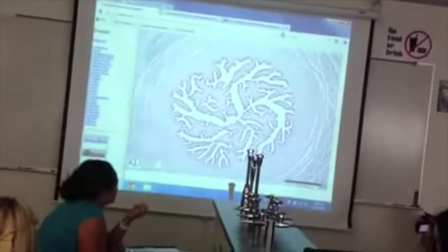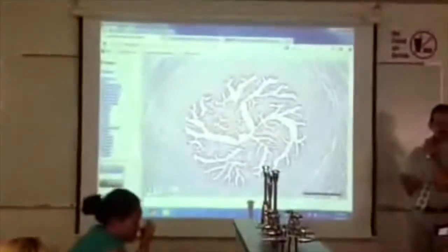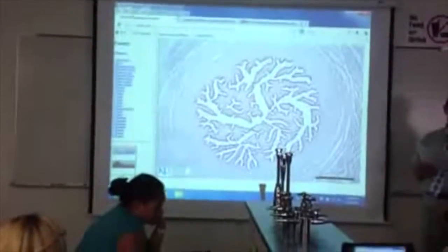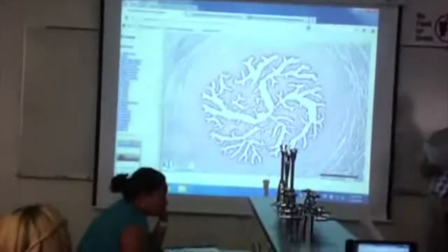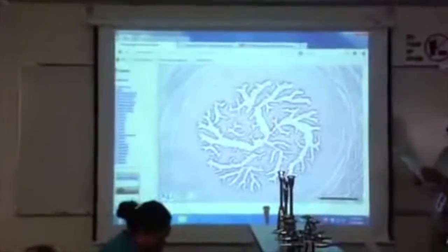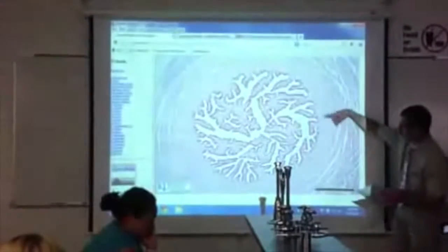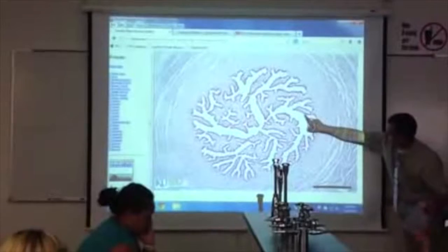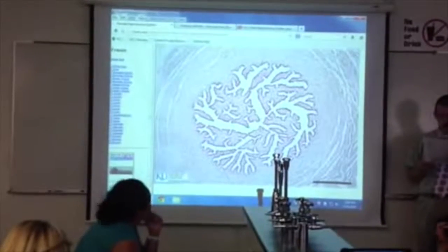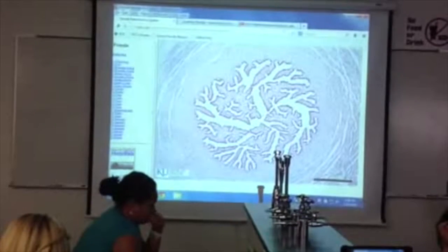So, what do you call the snowflake? Folded mucosa. Who else had mucosal folds? Seminal vesicle. Right. So we have mucosal folds or folded mucosa. If you look carefully, there'd be some cilia on there. You can barely figure out that they're there. But there'd be cilia to help move the sperm and egg along. So again, it looks similar to the male tubes, but it's just different looking in terms of the structure.